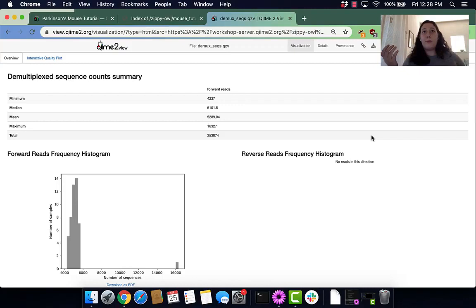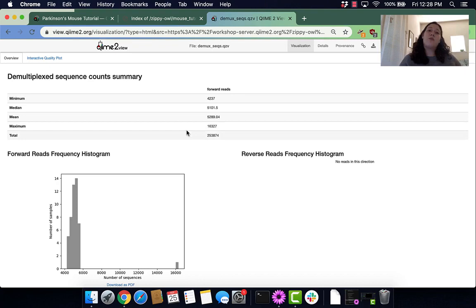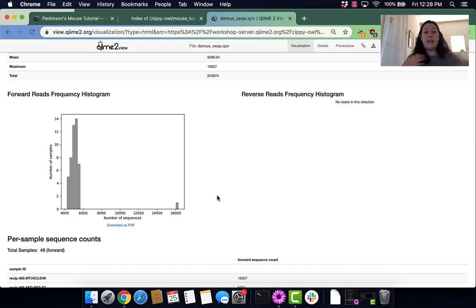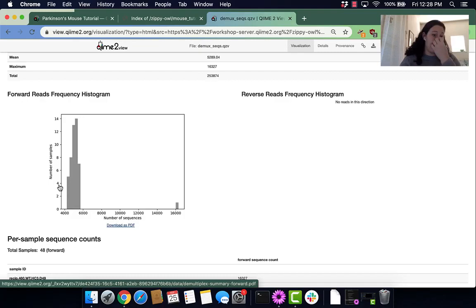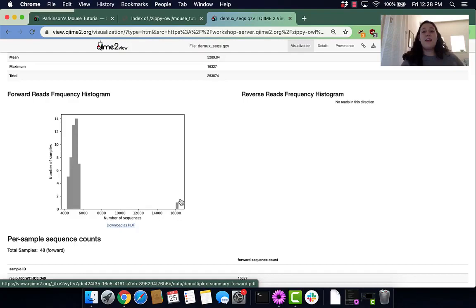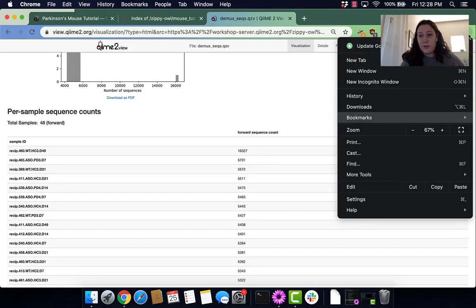Let's walk through what we see here. Here's our sequence count summary. It basically says what the minimum count is, what the mean count is, what the maximum count is, and what the total amount of sequence counts in our data is. We can see that visualized in this forward read histogram, which allows us to see that the majority of our samples have sequence counts that fall between 4,000 and 6,000, and one of our sequence counts is 16,000.